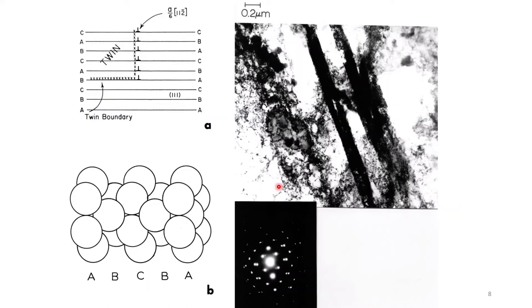This is a twin. My schematic shows a twin as a stacking fault: ABCBA — you change the stacking sequence of your atoms. The other reason I know it's a twin and not some other kind of fault is that it makes roughly a 90-degree angle. In my real space image, if I draw a line tangentially through my diffraction pattern, I get roughly 90 degrees. It's very important to make sure the orientation of your diffraction pattern is consistent with the orientation of your image, or analysis like this becomes really hard. Diffraction in this instance is image-based versus spectra-based — a little different than XRD.